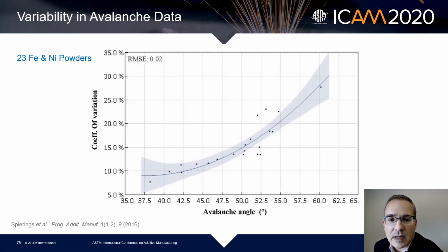And there's actually a publication from a few years ago that looked at 23 iron and nickel powders and showed this in a much clearer way. So definitely as flow diminishes, you'll see more variation with this technique, not unlike other methods.